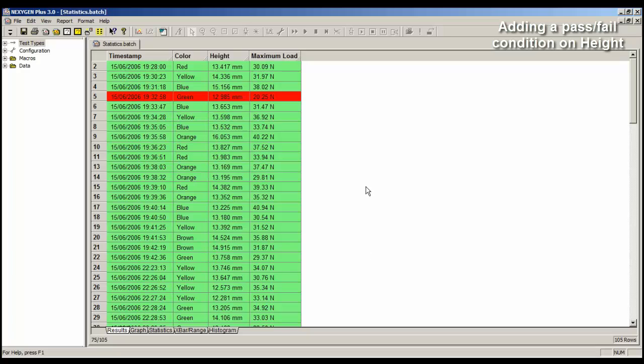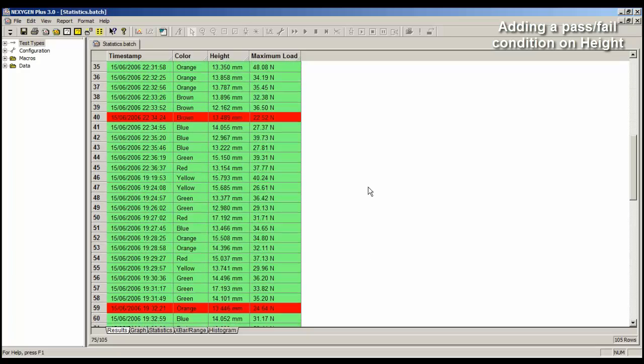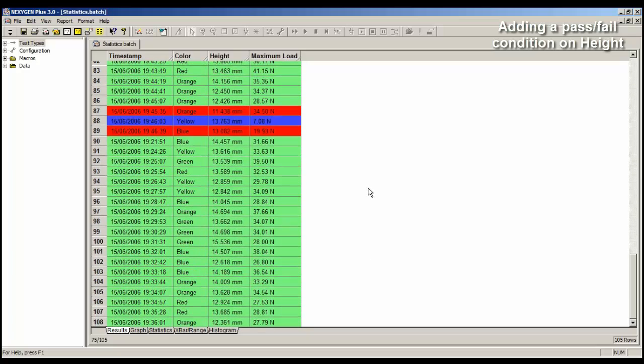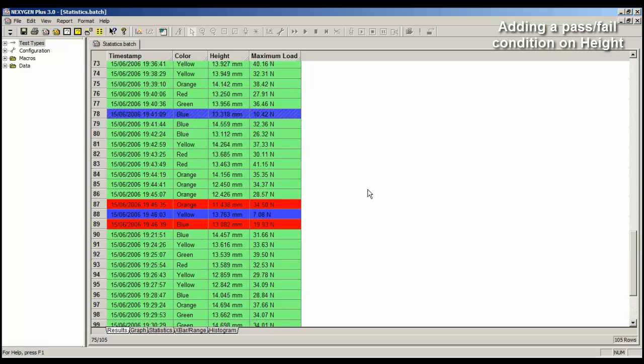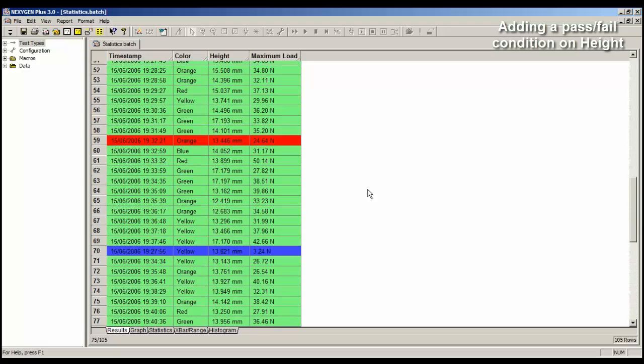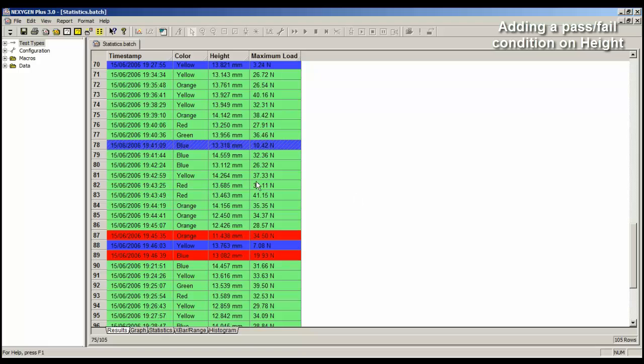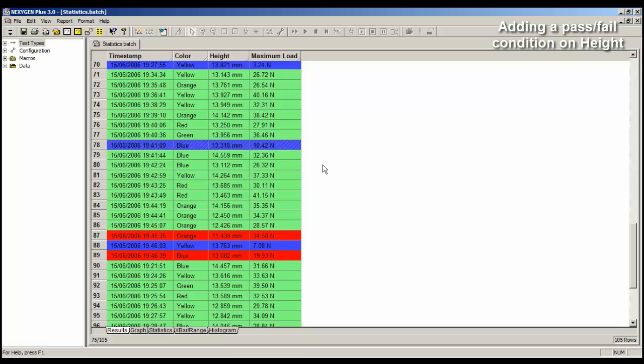Now when I scroll through the data, it's not easy to see which tests have failed, because of height. We can see also that we have good rows in green, failed rows in red, and rows we have excluded shown in blue.